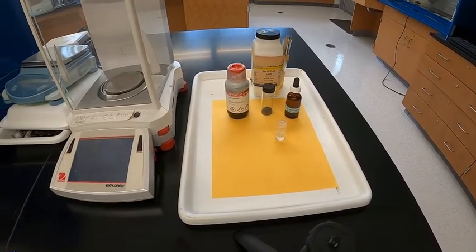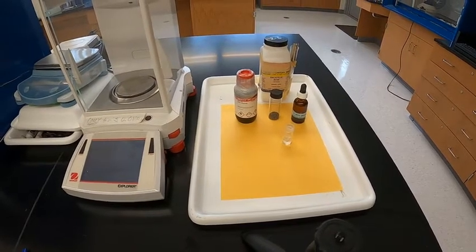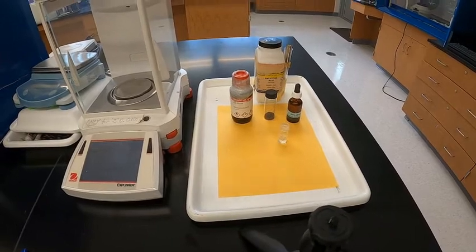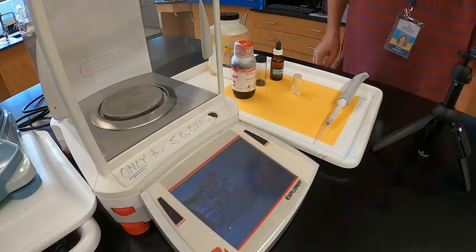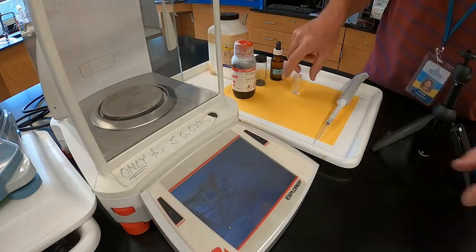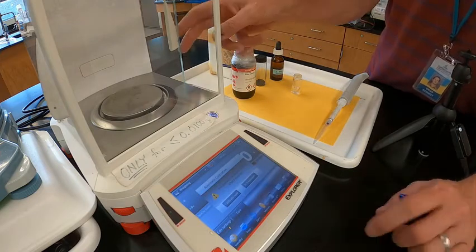Next we'll start the massing and the other reactants and then start the reaction. Now we're ready to add the reactants, and the first step is to mass the empty vial. I'm turning on my balance to make sure it's reading 0.